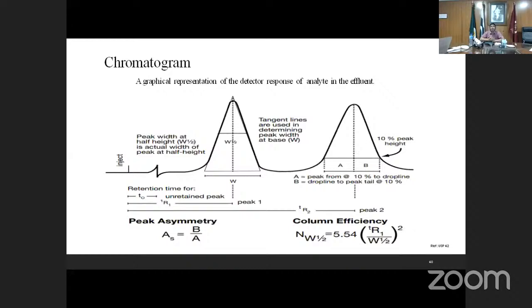Yesterday we discussed analytical HPLC and the introduction of chromatography, as well as the solvent system, the solvents which we are using in analytical HPLC.